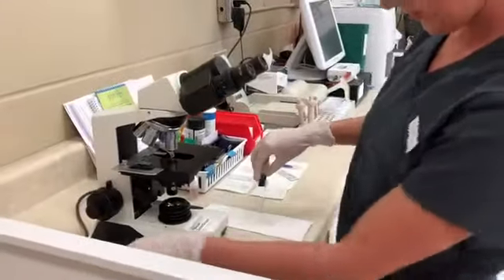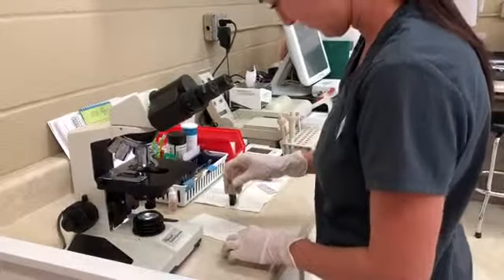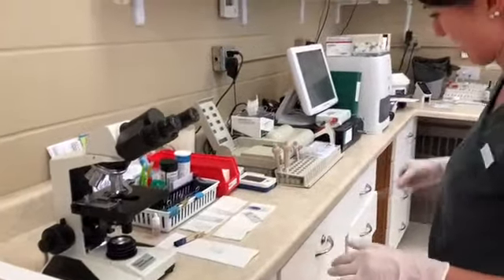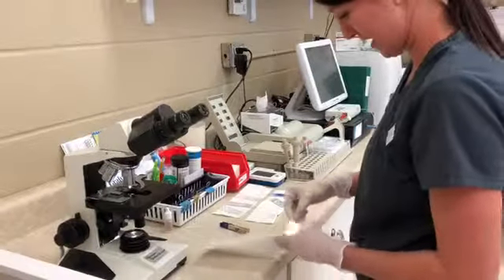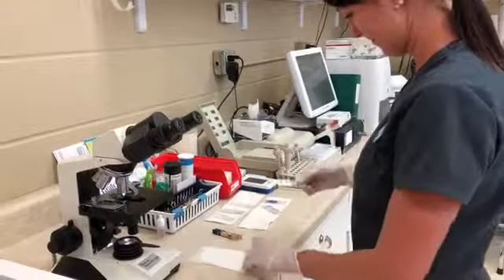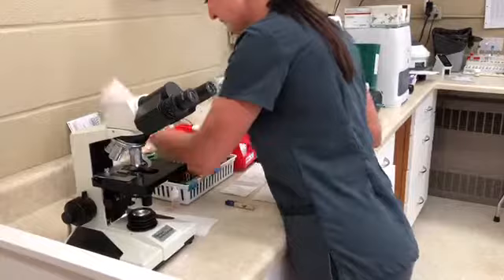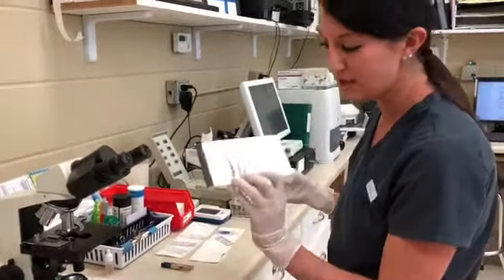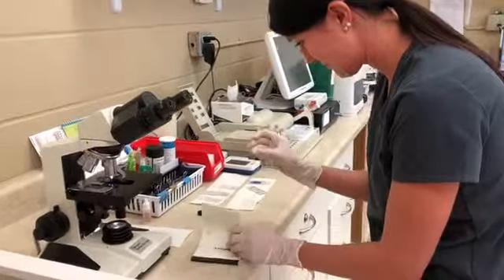Go ahead and turn the microscope on. Make sure it's nice and dry before we look at it — wave it gently in the air. If it's not quite dry, you can take this absorbent paper and stick the slide in here if it's just a little bit damp and gently dry it off that way. Perfect, this looks great.